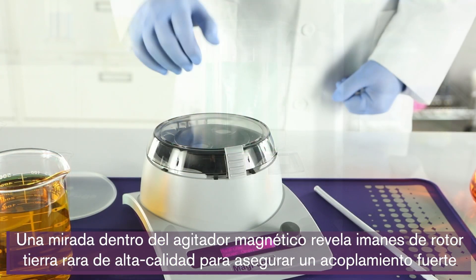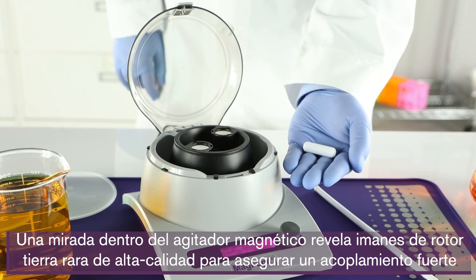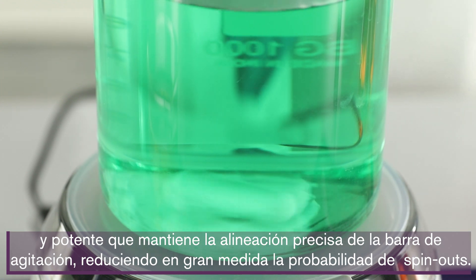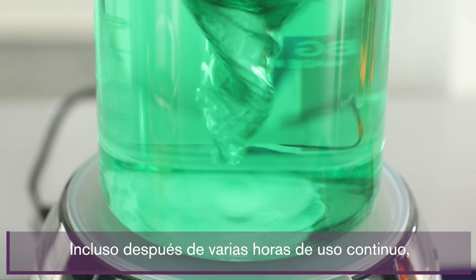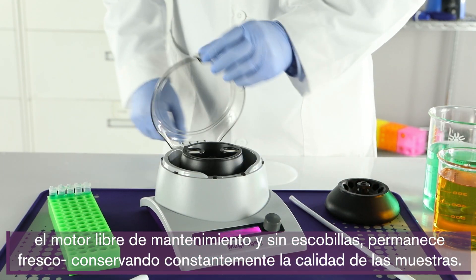A look inside the magnetic stir reveals high-quality, rare-earth rotor magnets to ensure strong, powerful coupling that maintains accurate alignment of the stir bar, greatly reducing the likelihood of spin-outs. Even after several hours of continuous use, the maintenance-free brushless motor remains cool, consistently preserving sample quality.